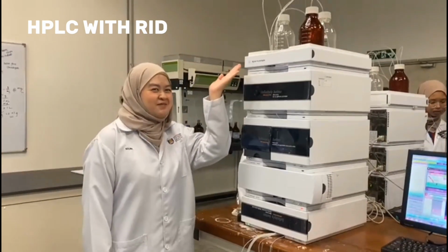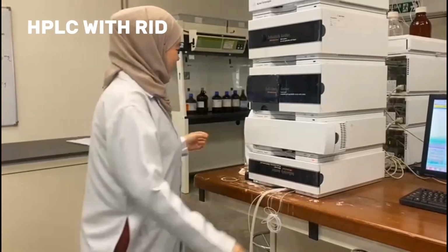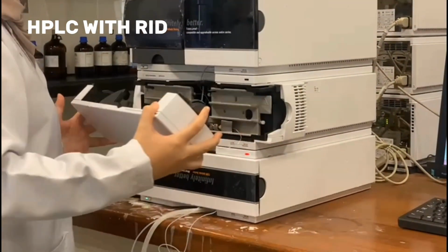This is the mobile phase in HPLC for refractive index detector. The refractive index detector measures changes in the refractive index of the mobile phase caused by the presence of analytes. Some common mobile phases used in RID are acetonitrile, methanol, and isopropanol. In this HPLC, a guard column and analytical column are two components often used together to enhance the performance.